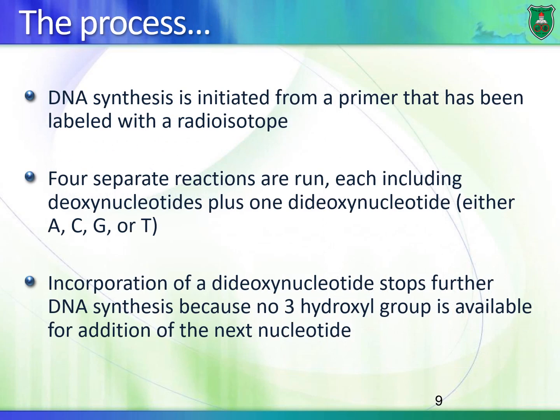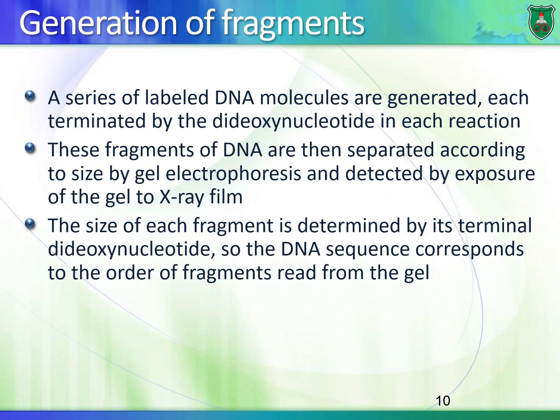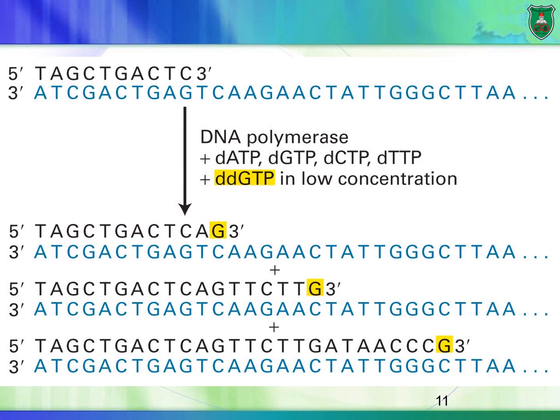So this is what we do. Okay, you can read this on your own. Idea here, and you can read this. So here's what we do. Remember what I always say, that whenever I talk about a DNA molecule, I'm not talking about a single DNA molecule. Rather, I'm talking about thousands to millions of DNA molecules of the same type. Okay, so whenever I want to do DNA sequencing, I need the following.